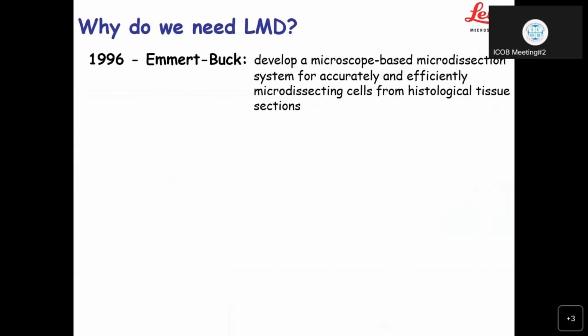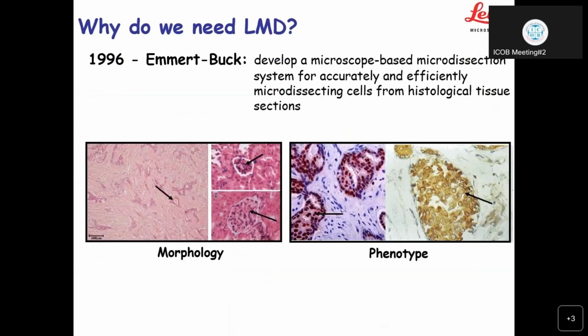Why do we need LMD? In the beginning, in 1996, Emmert developed a microscope-based microdissection system for accurate and efficient microdissecting of cells from histological tissue sections.